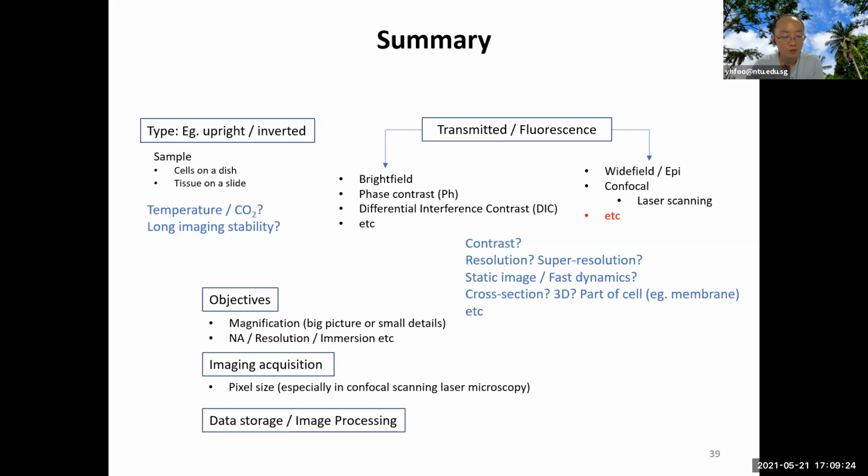Then after that, of course, we covered the pixel size and proper sampling. You have to take note of your pixel size, because I encountered a lot of users who, after a few experiments, tweak some stuff and it messes up their pixel size, and they don't know until months later or when they are about to publish.